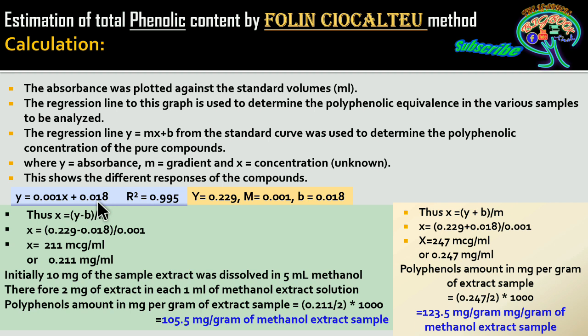This is the value. Further, you are going to subject the values into the formula. Before that, you make a modification in the formula to calculate the concentration of the unknown, so that x is equal to y minus b, divided by m.